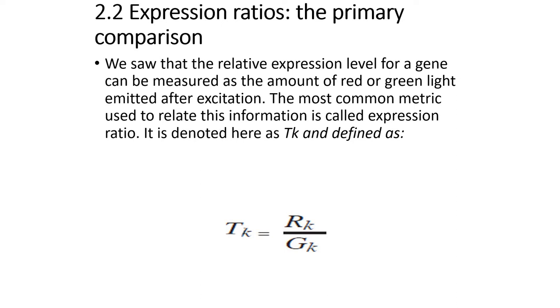We have two types of signal, red or green. These are types of fluorescent dye which produce different signals for different kinds of spots, because we have taken different conditions in the microarrays. In the last classes we also discussed that the microarray is sampled in different conditions: red is for one condition and green is for another.